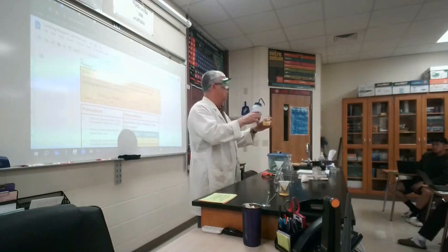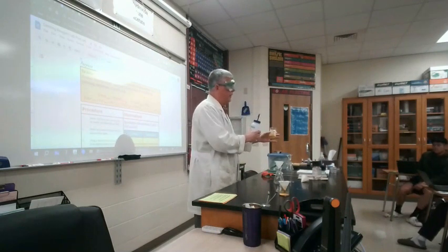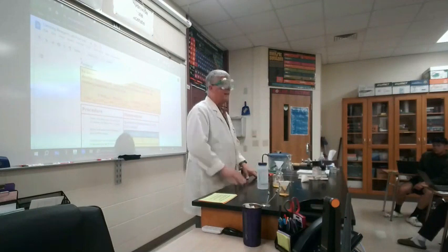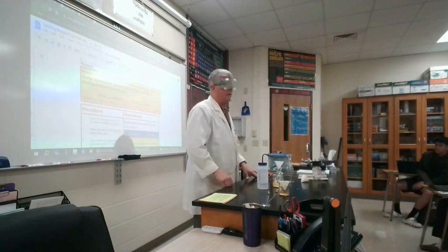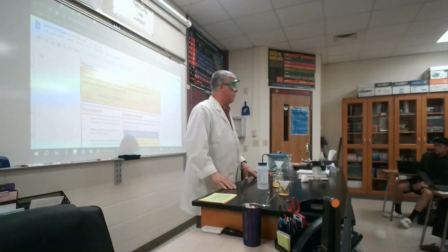Take your water, wash it down. Again, don't use a lot of water because you've got to get rid of it, but use some. Swirl it around, let it sit. This will start dripping through. That'll be sitting there. You can literally start working on your calculation. You've got them done on paper. You need to type them in after the lab. Okay?